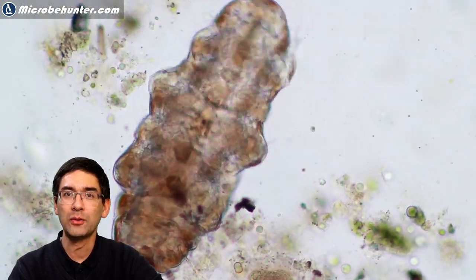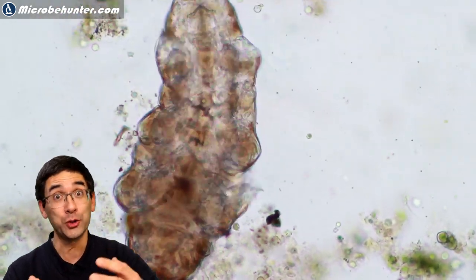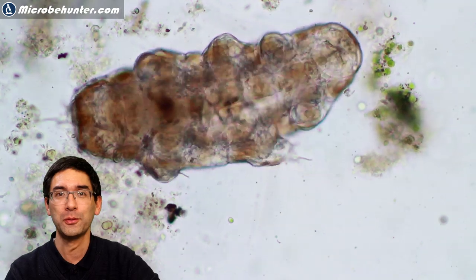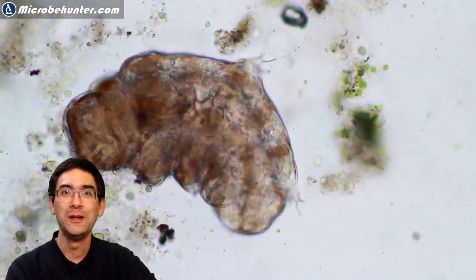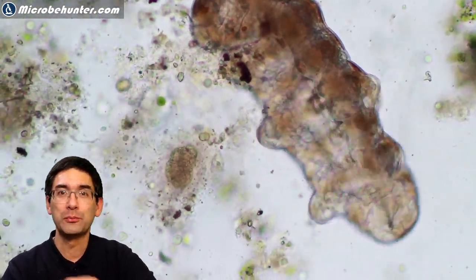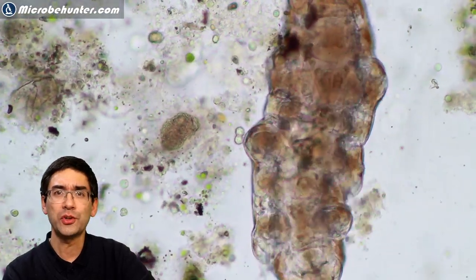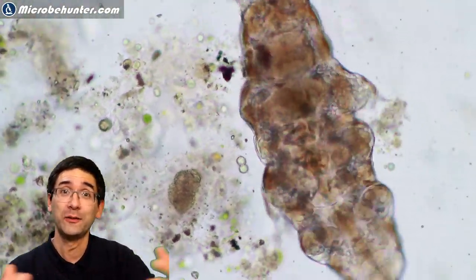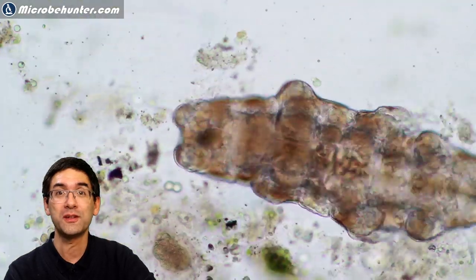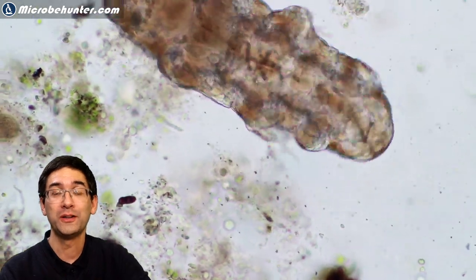The tardigrade has now flipped onto its belly and we can watch it move along. The glass slide is so smooth that it keeps slipping — fortunately, otherwise it would run away and be difficult to follow. The whole thing is also surrounded in water, so it's slippery because of the liquid medium. I wondered what it's eating. Some of these are even carnivorous — not only carnivorous, they are cannibals, actually eating smaller tardigrades as well. Many of them are plant-eating.